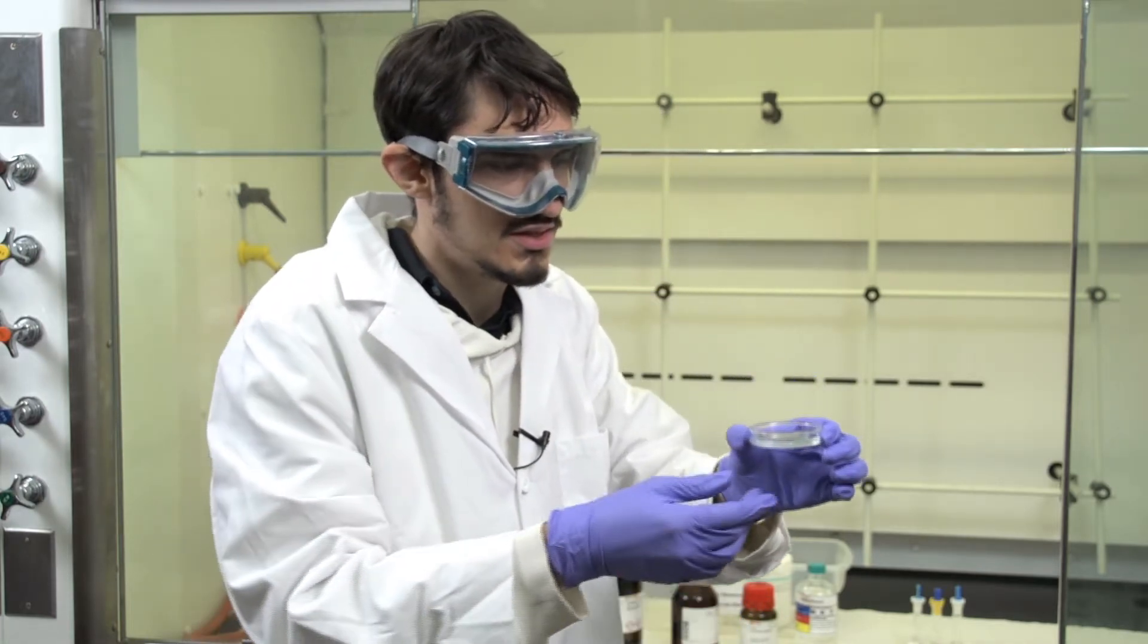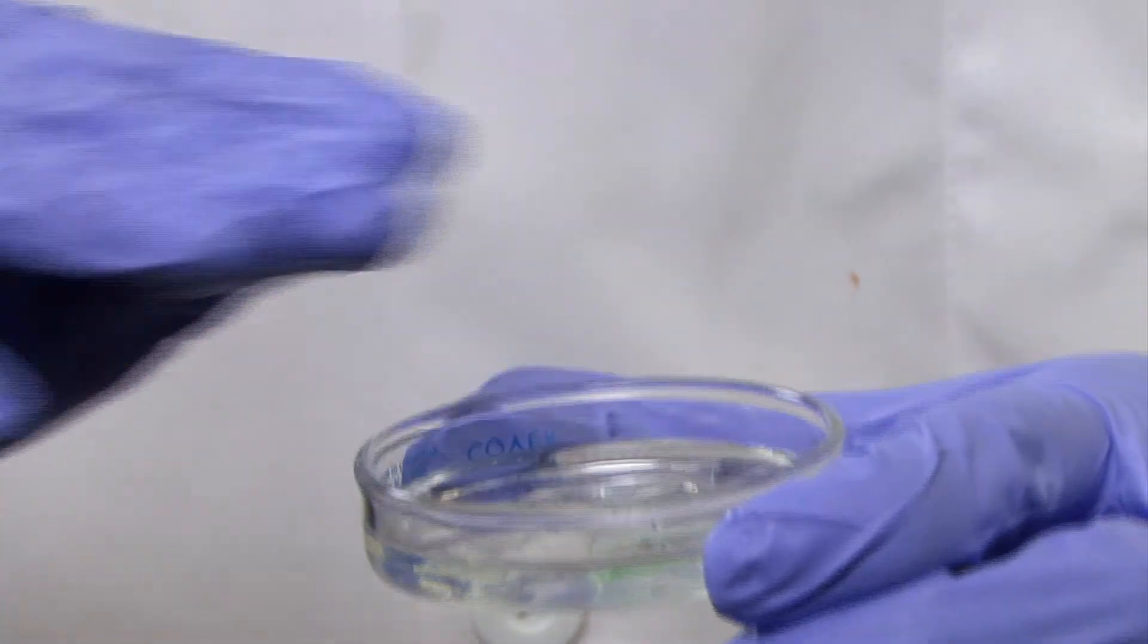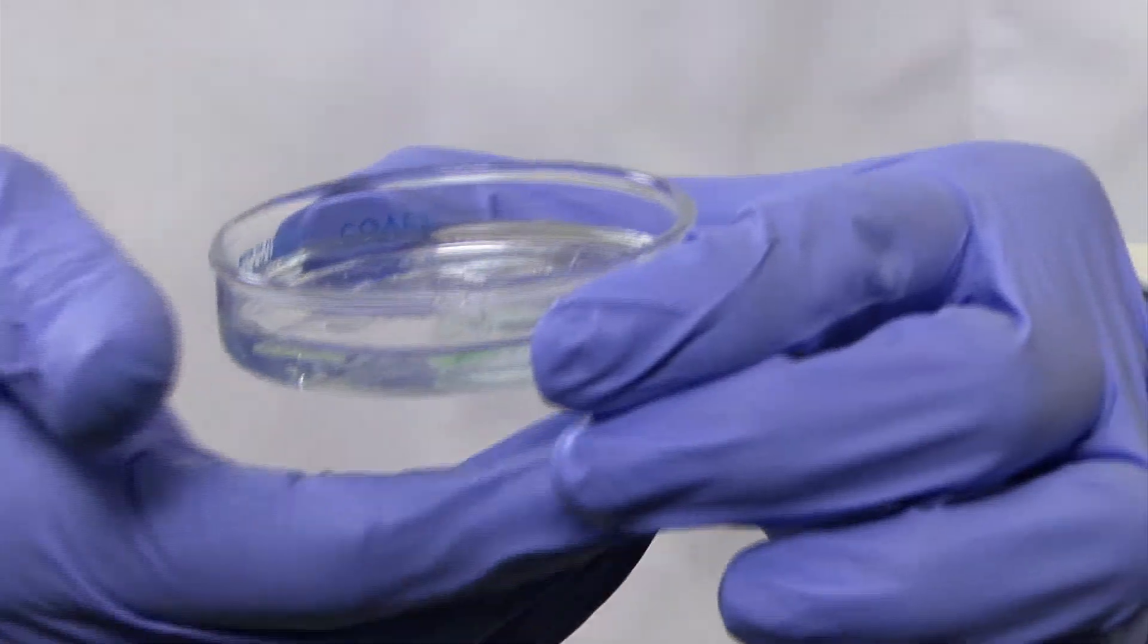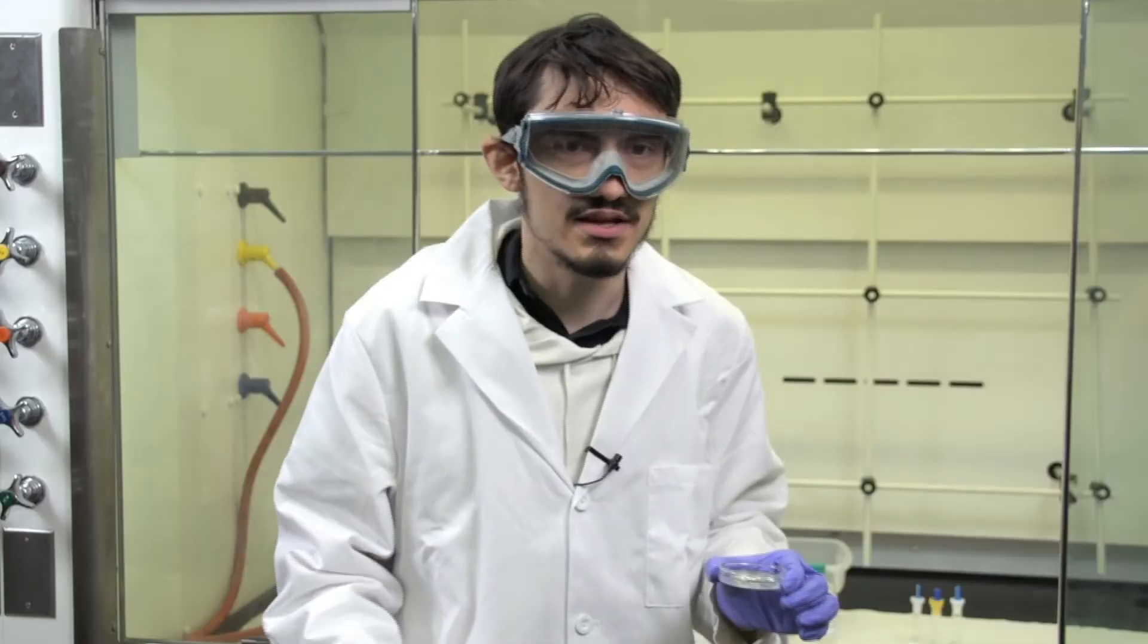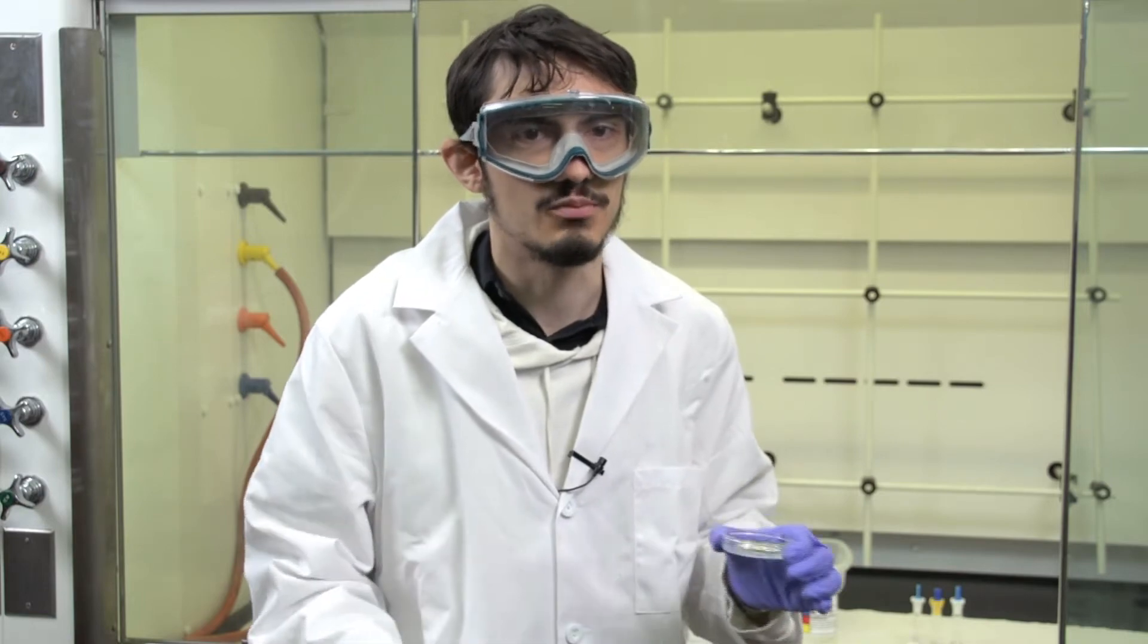Once you have poured over the CD it will look something like this. You'll have a relatively uniform layer of the polymer on top and you are now ready to place the Petri dish in the oven so that the polymer can be cured.